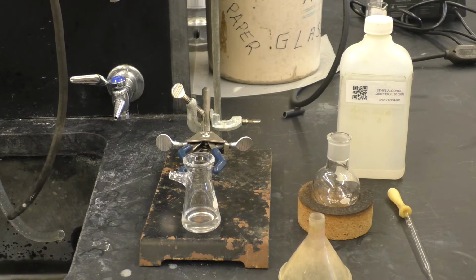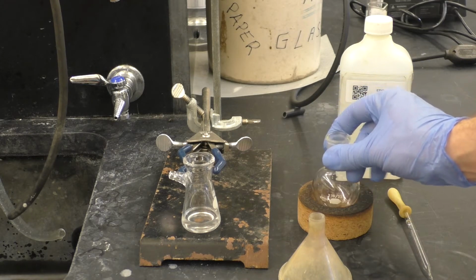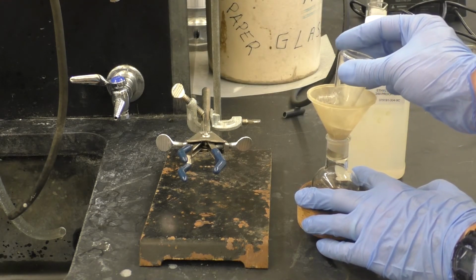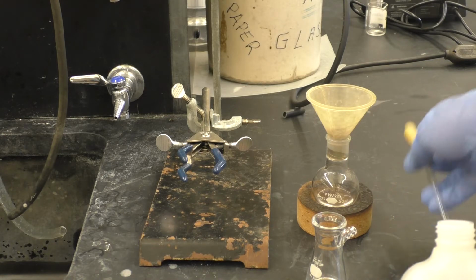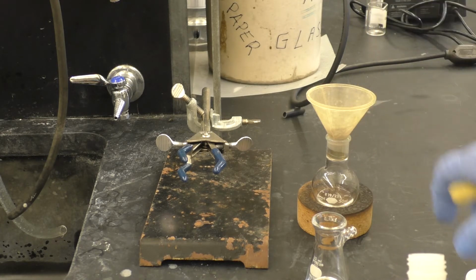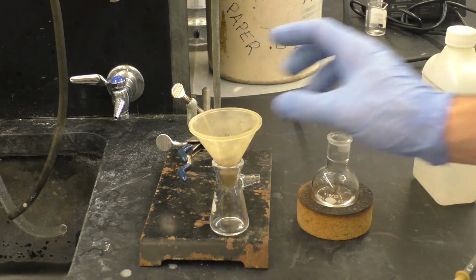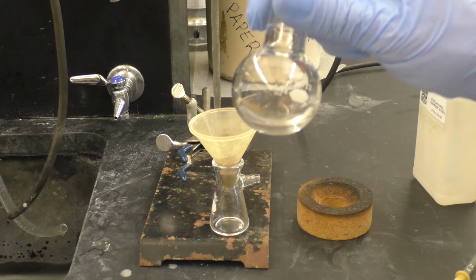And to do this, it's more convenient to have your material in a round bottom flask. So I have a new round bottom flask that I've grabbed from the stockroom here, and I have a funnel. I'm simply going to place the funnel on top, not really filter at all, just simply dump my solution down into the round bottom. And then just to minimize losses due to transfer, I'm going to rinse the filter flask with some additional ethanol, and then pour this down through again. Now I'm all set to take this to the rotary evaporator, or the Rotovap, and remove the solvent to leave me with, ideally, my purified product.